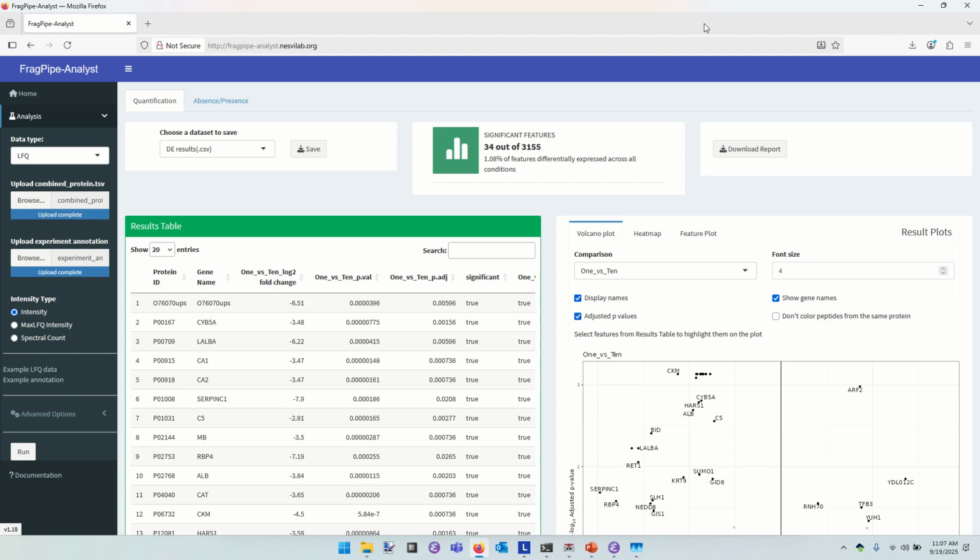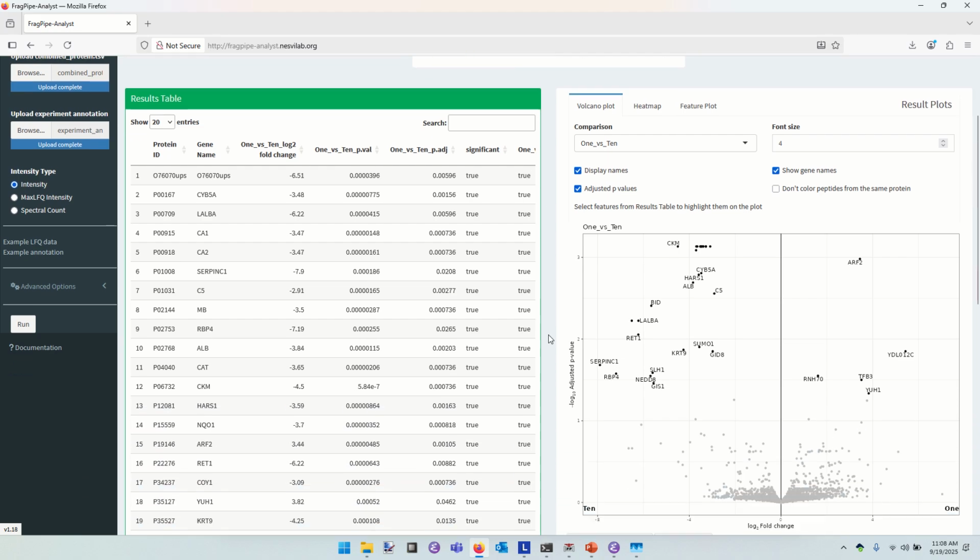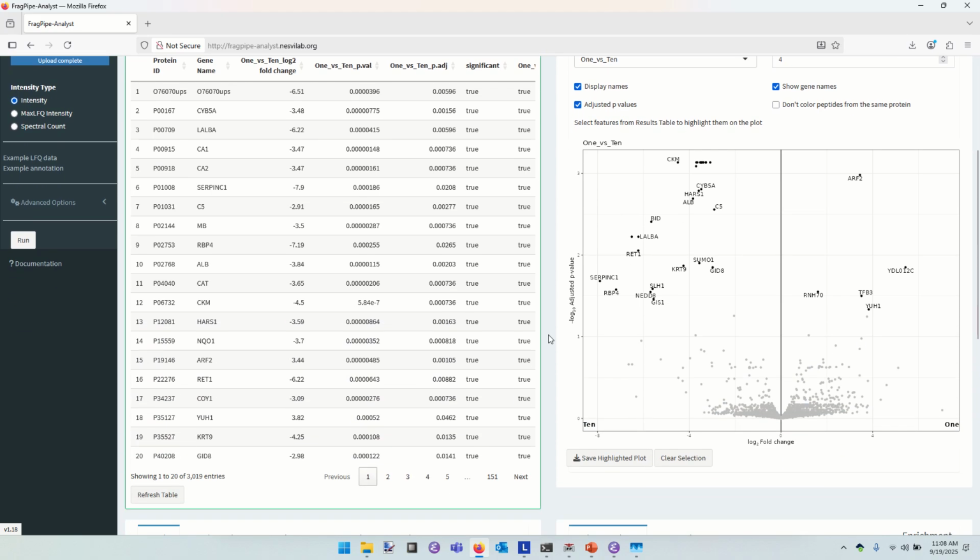Okay, so we now have our table. It's probably been sorted by the adjusted p-values, etc. Does everyone know what a volcano plot is? Have you all encountered these? They sometimes give statisticians a bit of a fit, but we'll try to overlook that for just a moment. This is a volcano plot. It's easily the most common way that folks in microarrays or proteomics ask what differs between a pair of cohorts.